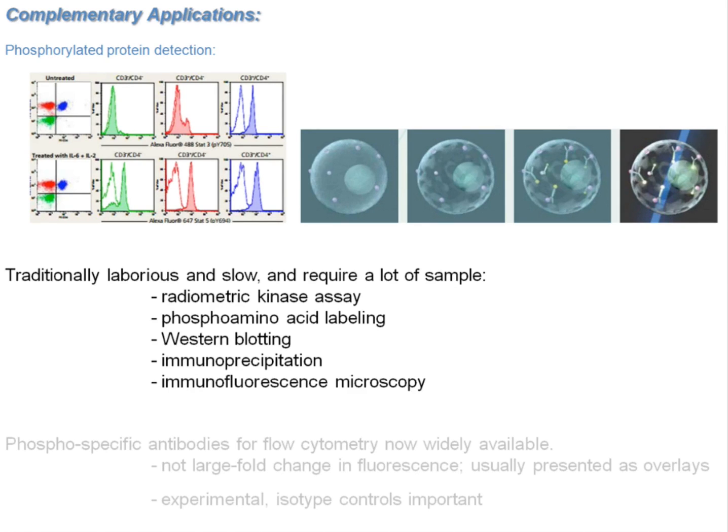And again, we can use this alongside cytokine staining. This is one thing with all of them, that we really need to think of the experimental controls, and perhaps isotype or various treatment controls that we might want to use. Because we don't see a large effect, whether positive or negative, we need to consider that.